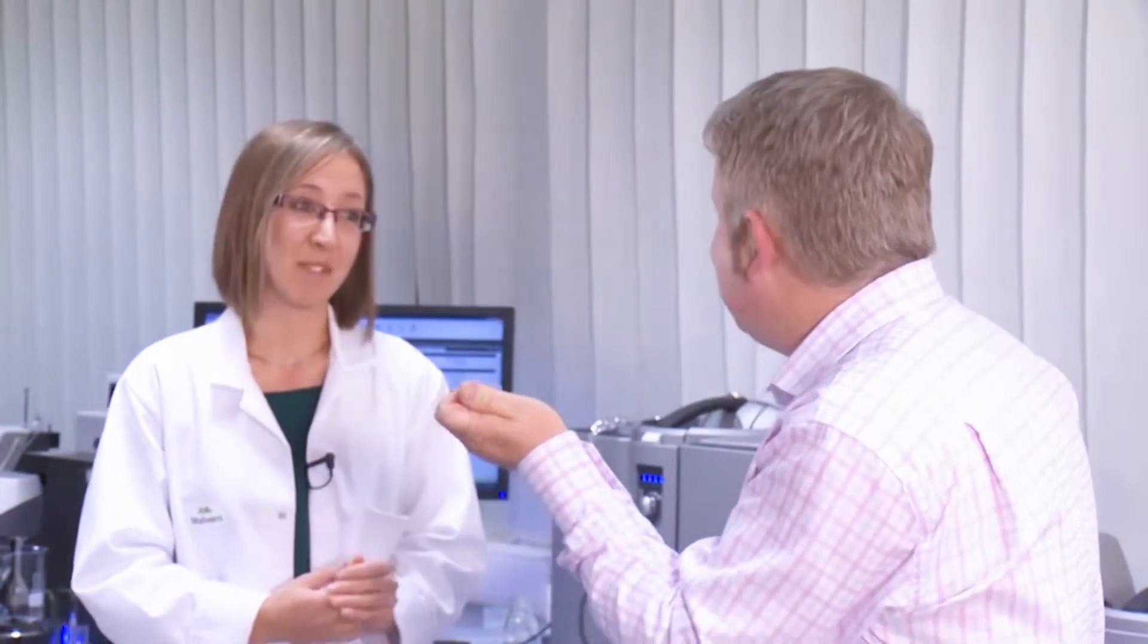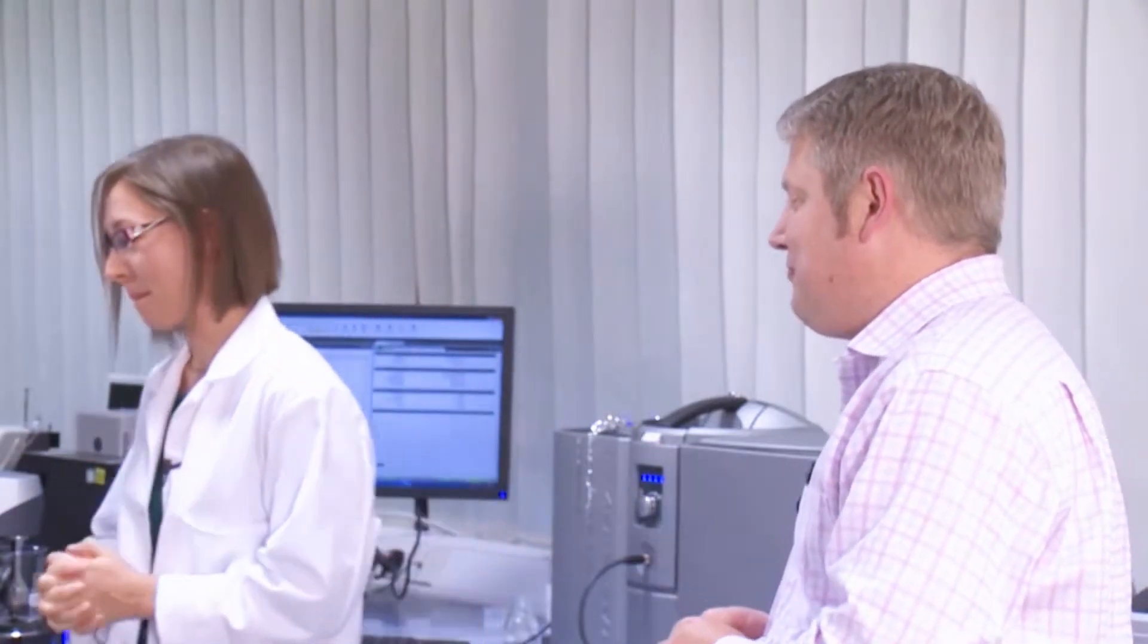So you might say they have a sample about this size? Well, sometimes even smaller than that. Even smaller? Yeah. OK, Debbie, well, you've answered one challenge. Is there something that you can provide Anne to help her in this case as well?